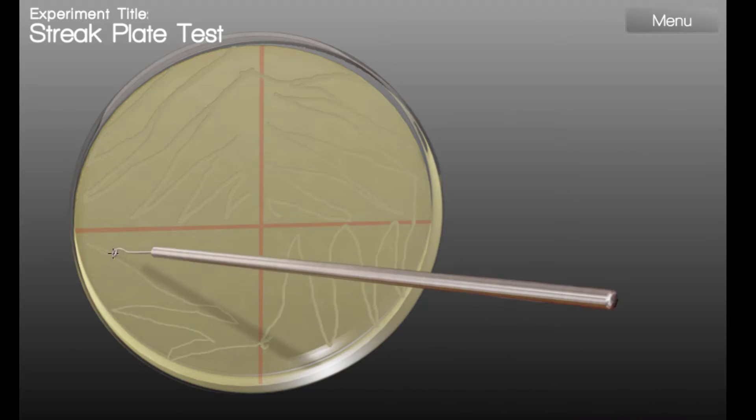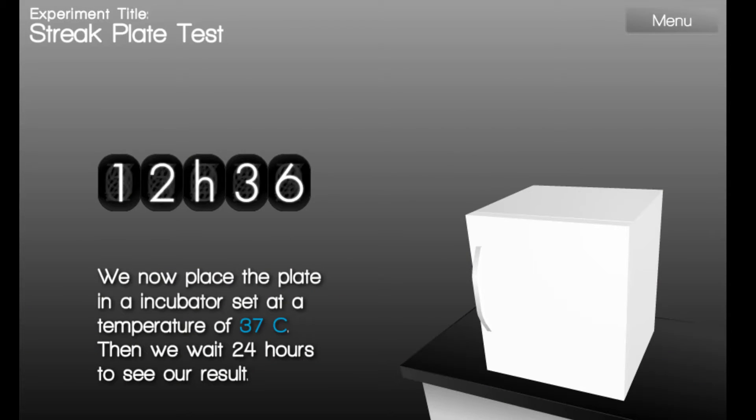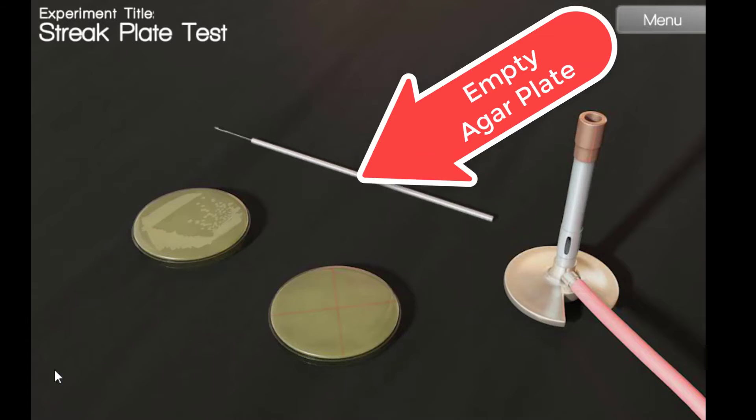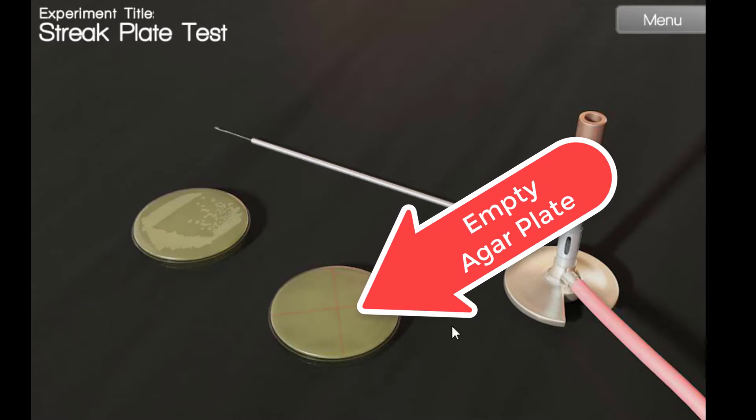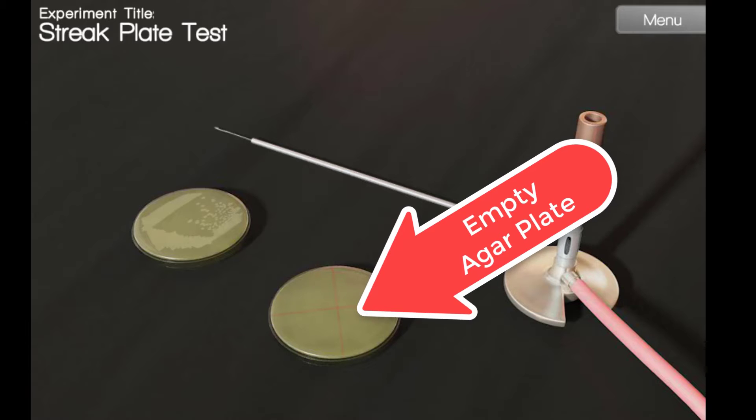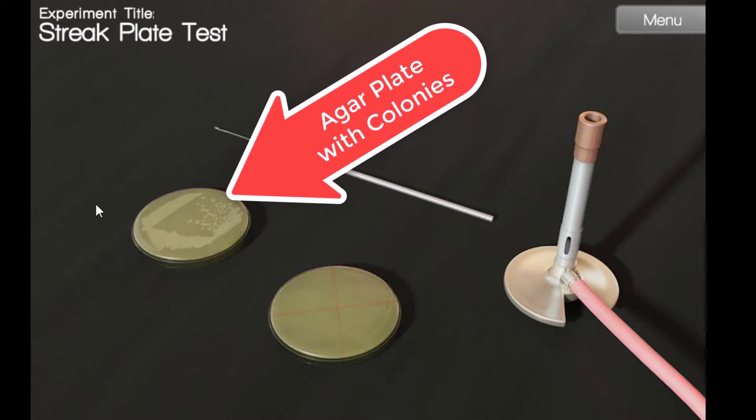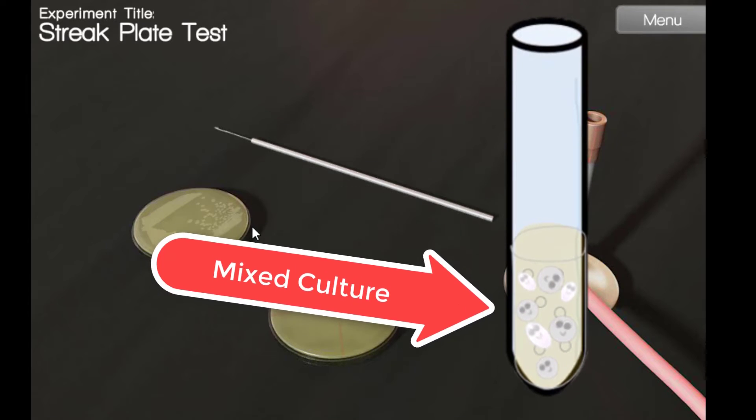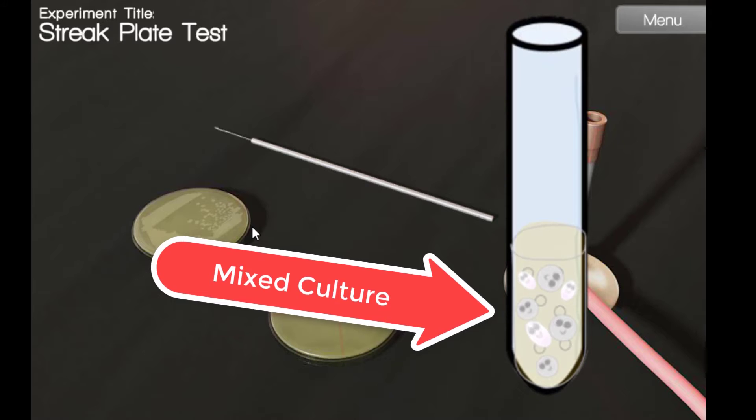Now, you are ready for incubation to allow your colonies to grow. Let's start our procedure. You see here that we have a Bunsen burner, an agar plate with nothing on it that has been marked into quadrants using a permanent marker. We have another agar plate that has colonies. This plate was made using a mixed culture having more than one species of bacteria.